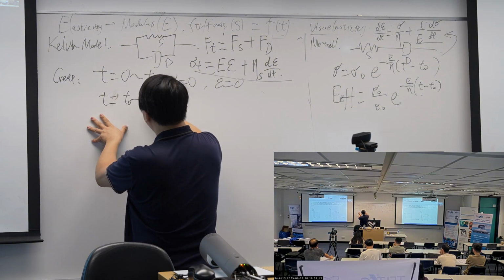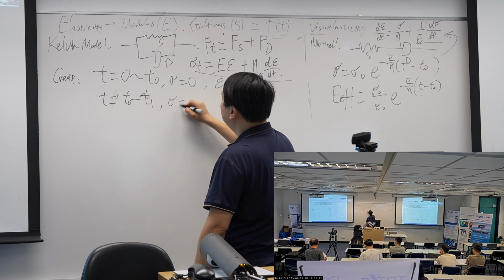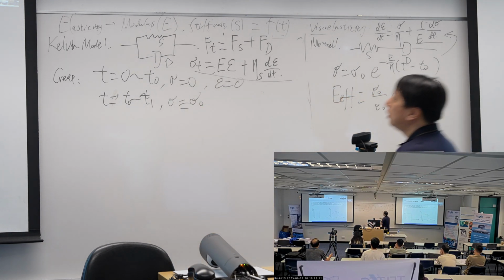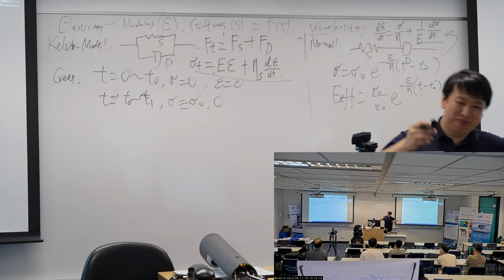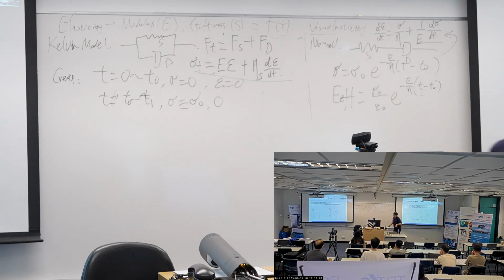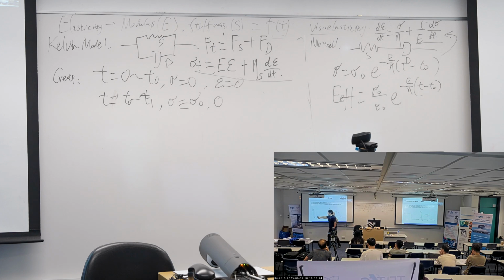From T0 to T1, my force is held at sigma 0. Let's charge it for a while. So from T0 to T1, the force is held at sigma 0.